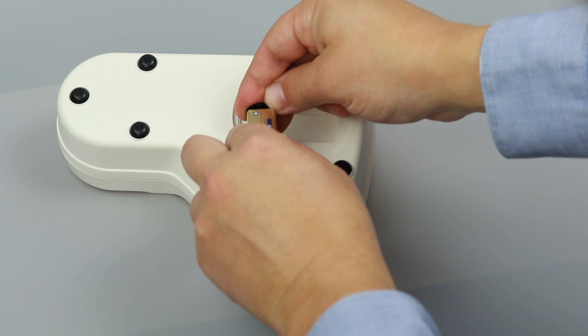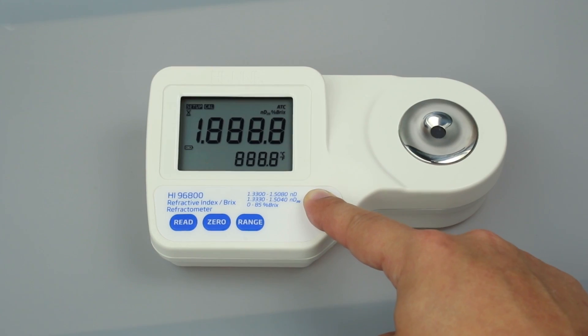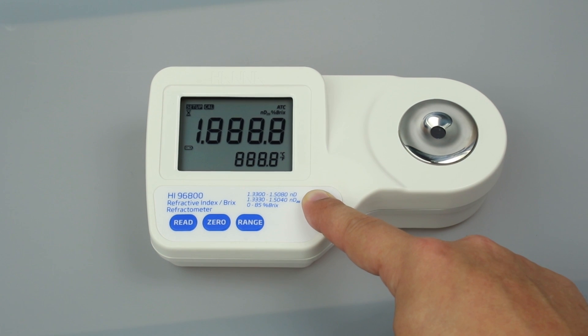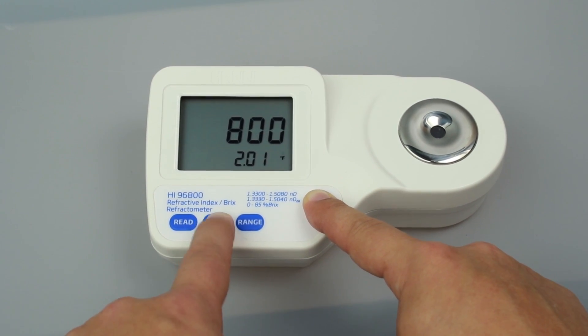To set up your meter, install the 9-volt battery in the compartment. To select your temperature units, press and hold the ON-OFF button until the screen flashes. Continue holding ON-OFF and press 0 to change from Celsius to Fahrenheit.